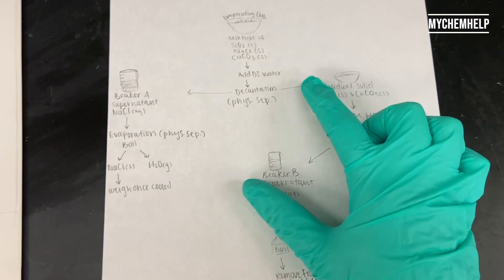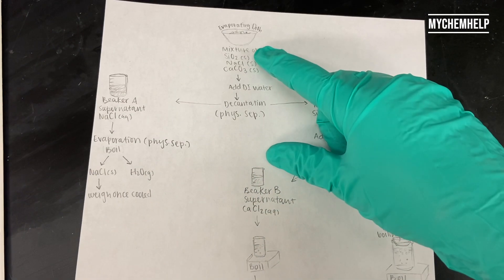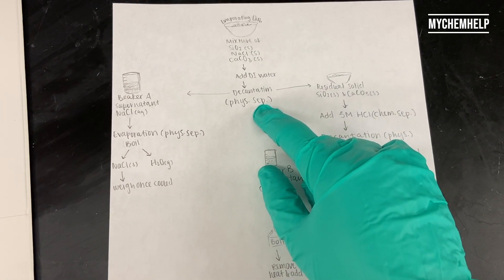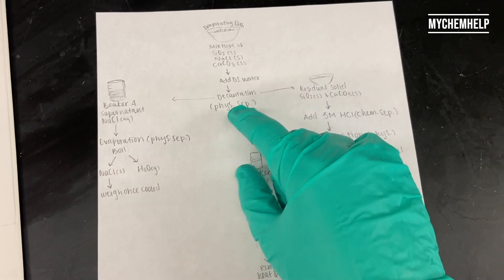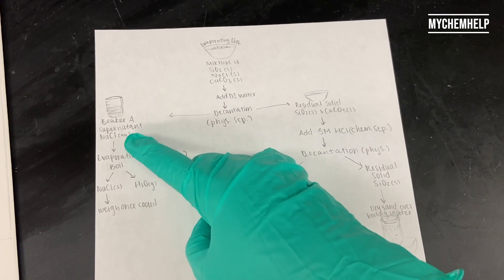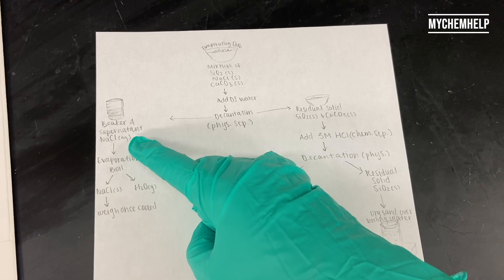So the first thing we're going to do is add some DI water to our evaporating dish. We're then going to decant, which means to pour off the liquid portion, and we're going to decant into a pre-weighed beaker, and in that beaker is going to be our aqueous sodium chloride.